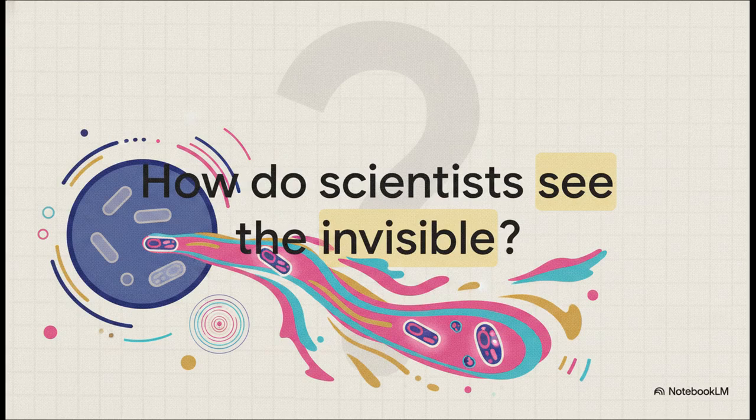Picture this. You're peering into a microscope, looking at a clinical sample, and you see absolutely nothing. Well, that is the fundamental problem in microbiology. Bacteria are essentially transparent. And, if we can't see what's making someone sick, we can't treat it. We desperately need a way to illuminate this hidden microscopic world.